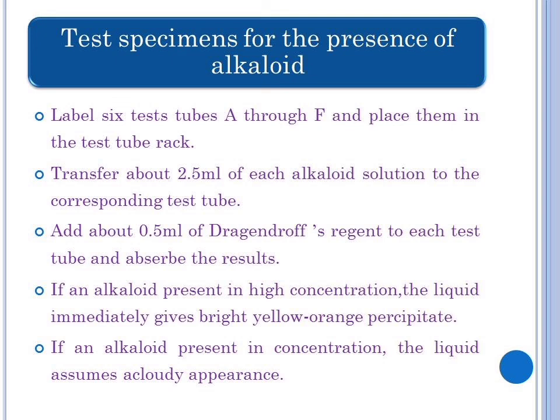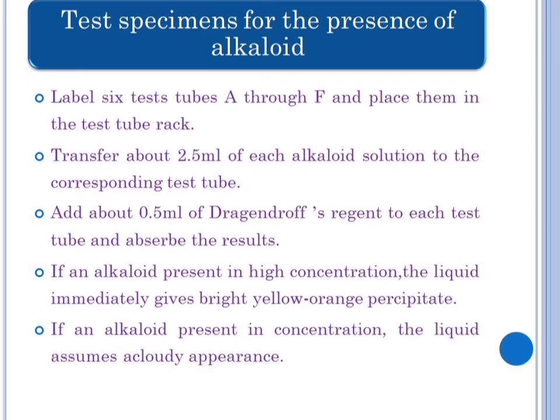Depending on the particular alkaloid and the amount present in the trace, a yellow-orange patch may appear immediately, or it may take a few minutes to become visible. Using a fresh swab each time, repeat the step for each of the other chromatograms also.